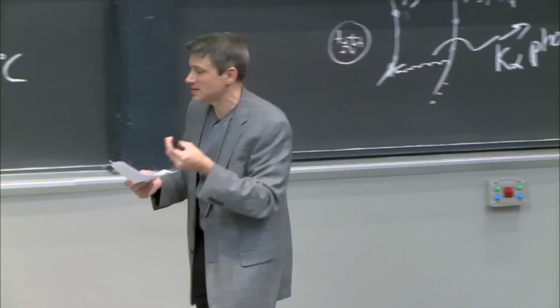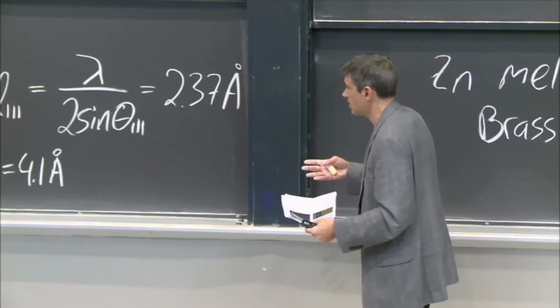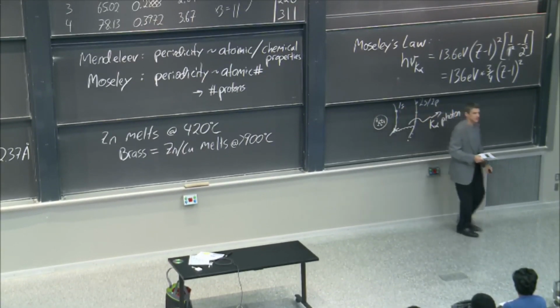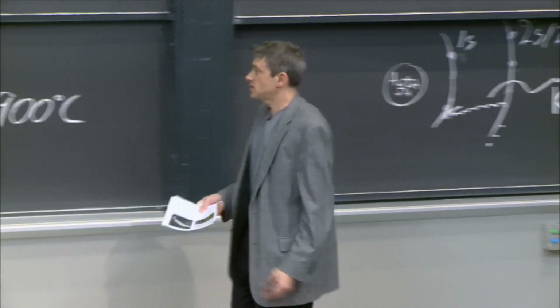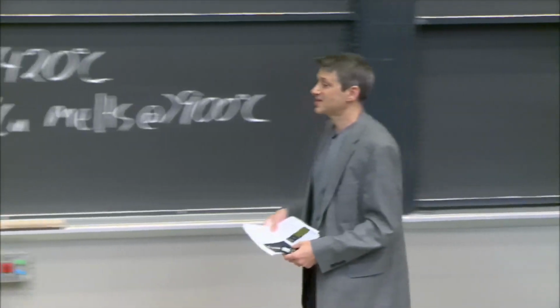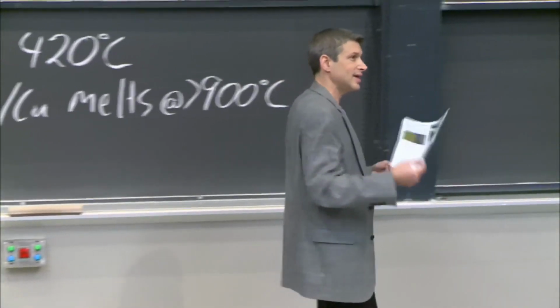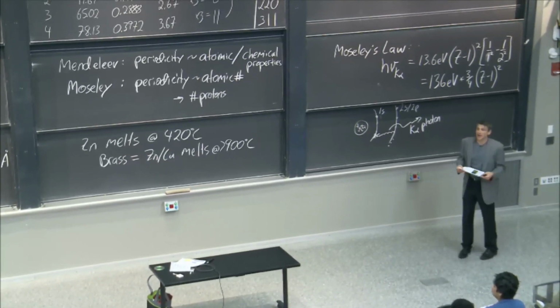Oh, look at the power. You can feel the power coming into that tiny little piece of metal. You know, now some of the time you get the transition that we talked about. You knock an electron out and you emit a photon, a K alpha photon, or maybe an L beta photon, right? And sometimes you slow the electron down so you get the Bremsstrahlung. Yeah, but there's so much energy being pumped into this material. And a lot of times, those electrons just collide and heat up the metal. That metal is getting extremely hot.